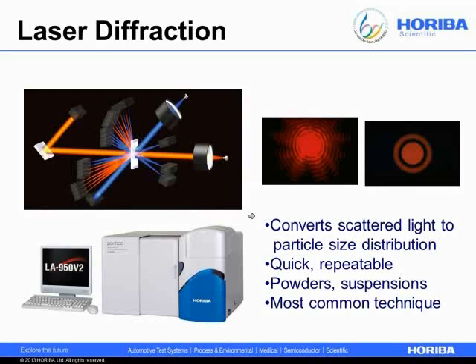And how laser diffraction works, in a nutshell, is inside the instrument you have your material that's getting circulated through either some wet flow system, or if it has the powder jet accessory, which would sit on top, it's being injected through the measurement zone and then evacuated into a vacuum. And when you're passing material through the measurement zone here, we are using a red laser and a blue LED, and a wet measurement only. And from those two light sources, we're generating scattering. So as the light hits the particles, depending on the size of the particles and certain other characteristics, we'll get scattering of different intensities at different angles.